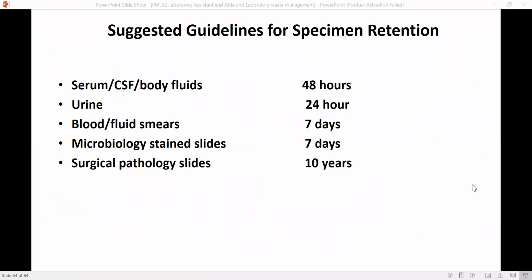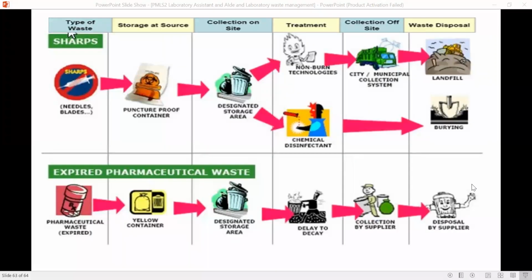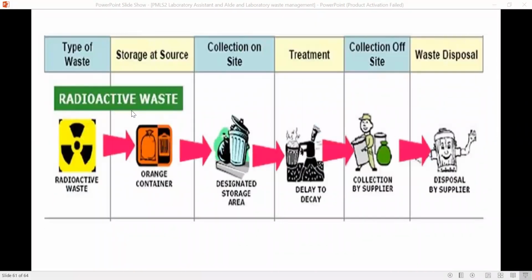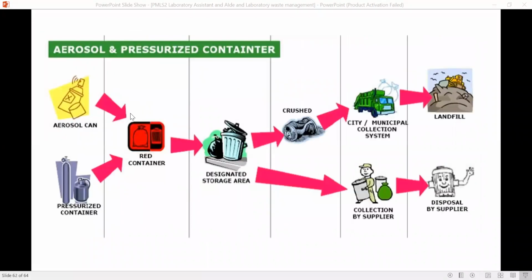Okay, now, this is the last slide. Okay, but before I go to the last slide, okay, so ayan yan ha, importante yung mga color. Tama, yan. Okay, mga kulay. No? At saka saan sila itinatapon. Okay. So tapon lang naman natin diyan, 'di ba? Landfill, tama no? So landfill can be vault, tama, can be yung safe burial, no? Okay.